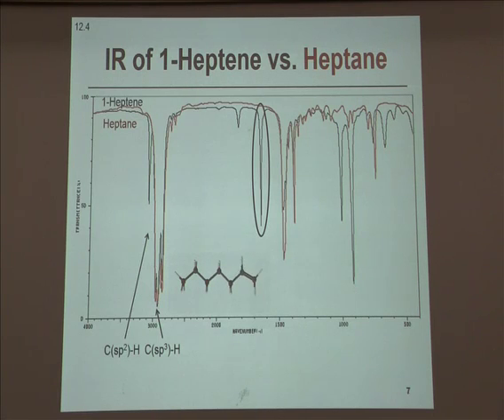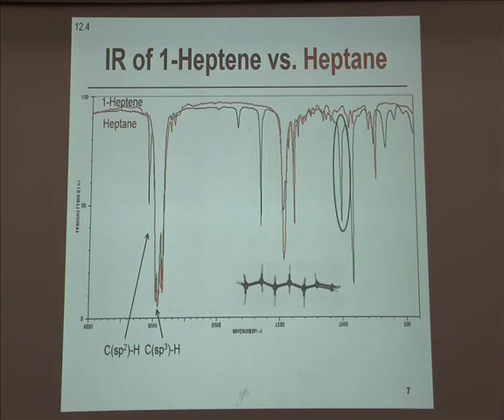And it's important to distinguish between the intensity of signals and the integration we use with proton NMR to determine how many of those atoms or molecules are making that signal, as opposed to IR, where the intensity doesn't tell us how many molecules or parts of the molecule are making that signal. What it tells us is something about the asymmetry of the atoms involved in that bond. And so here we see a moderate intensity because we have carbons on each end of that double bond.